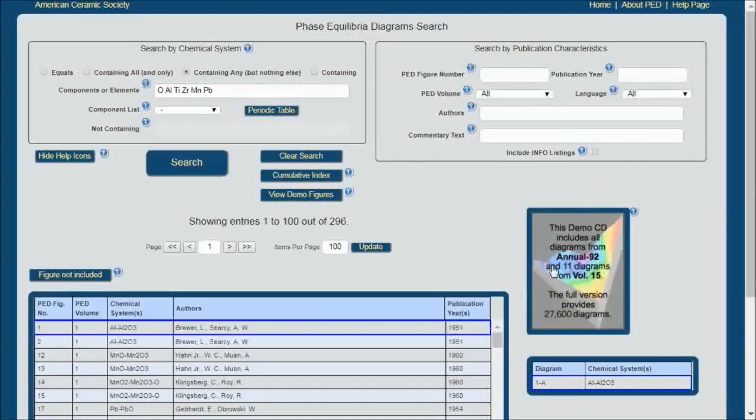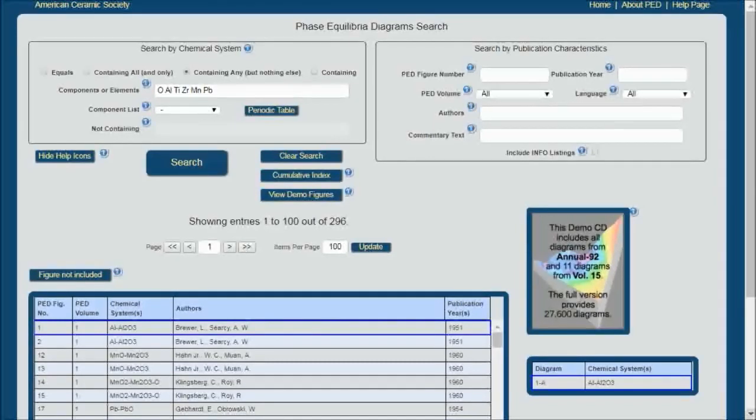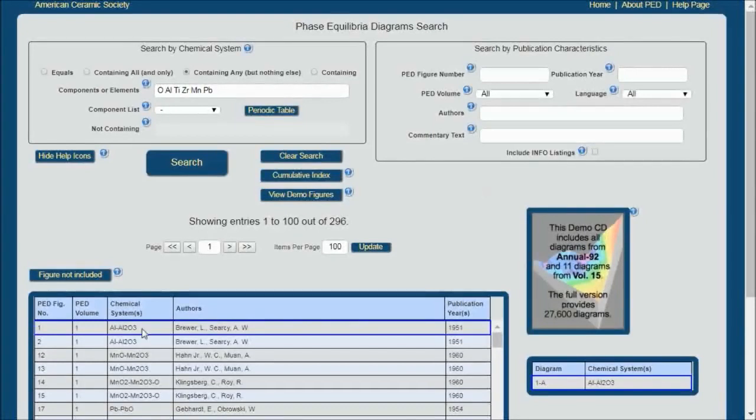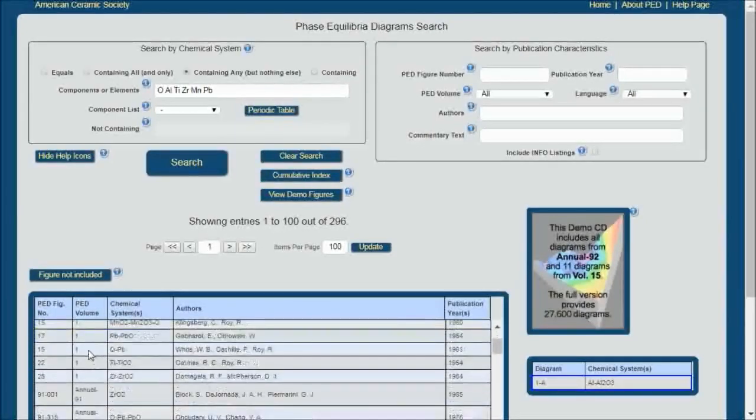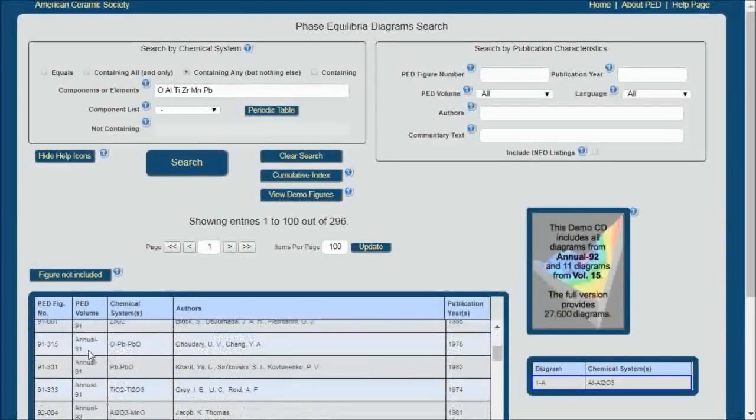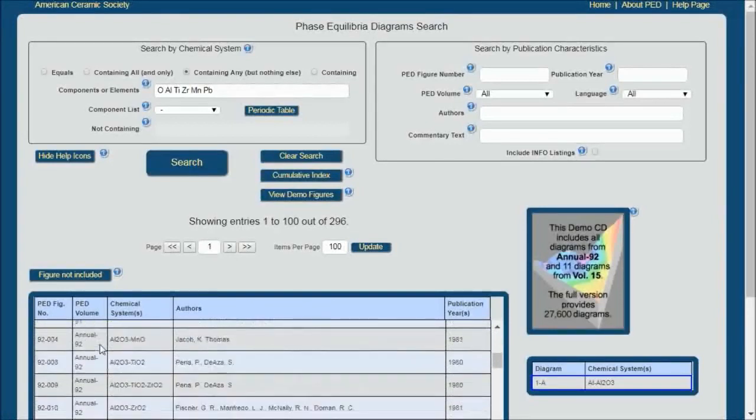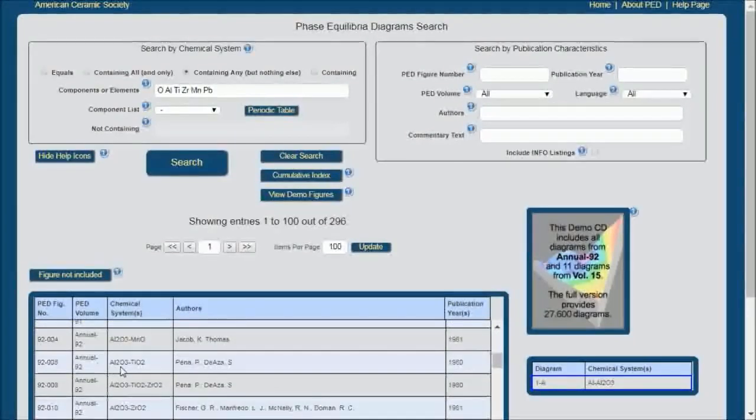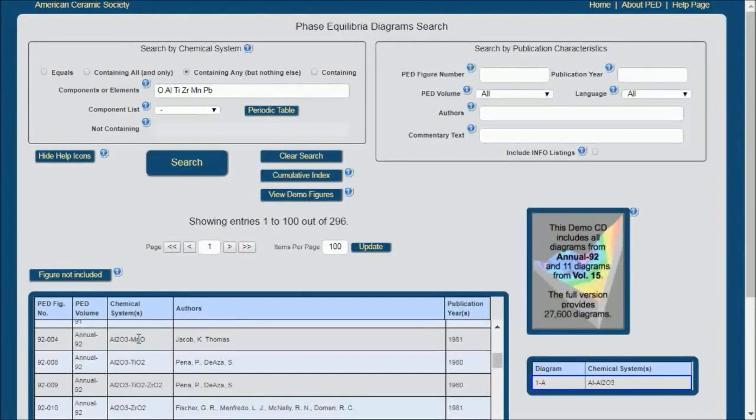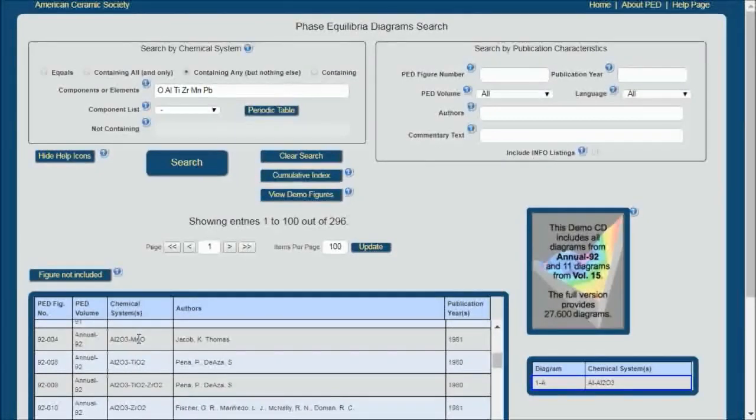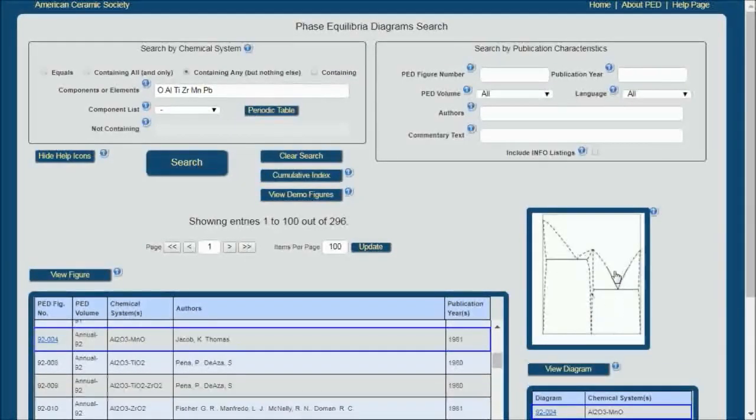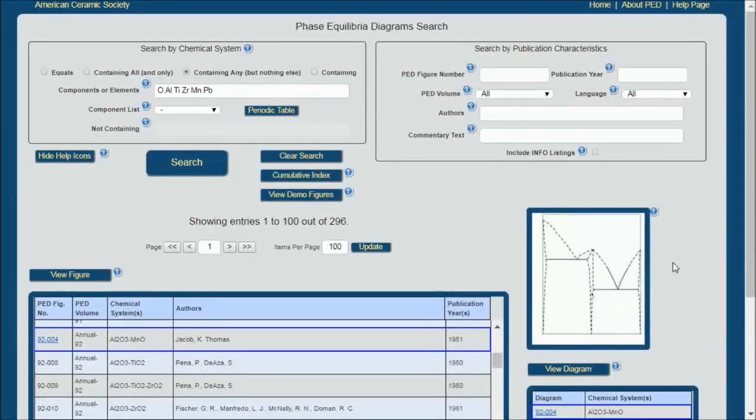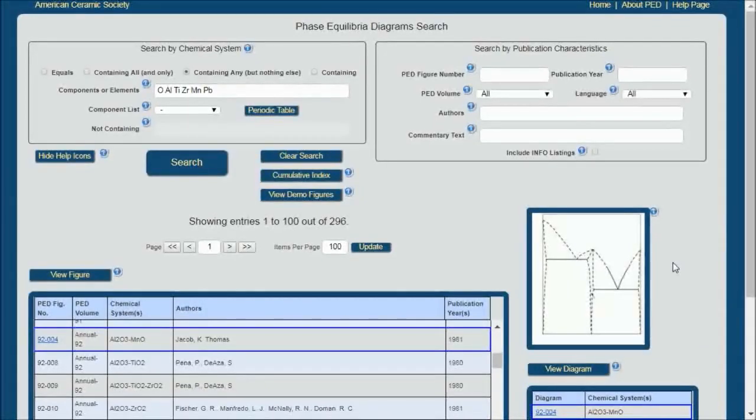As I mentioned, this demo has a limited database, and so I'm going to choose something from Annual 92. So we'll just scroll down here and you'll see Annual 92. So I will pick this alumina manganese oxide system, and you'll see in this window here a preview, and in part two you'll see where that preview becomes quite useful.